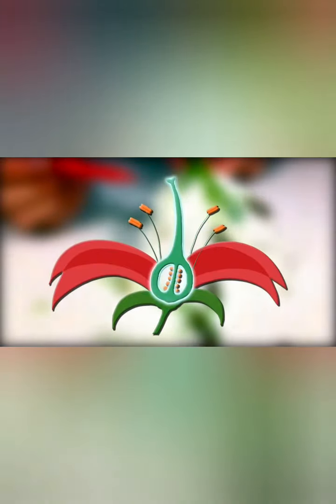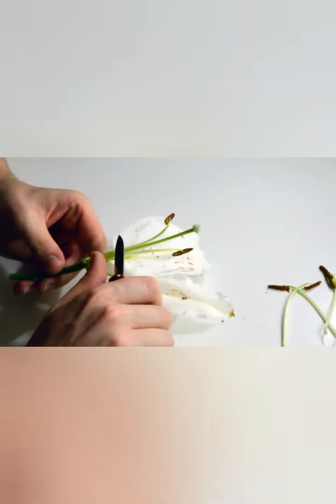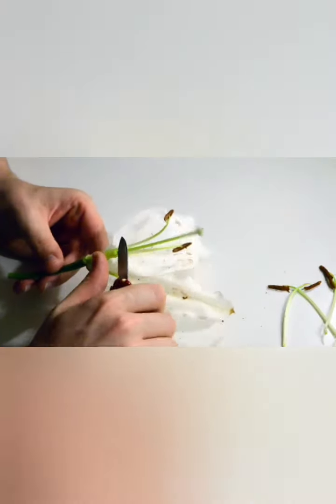In the diagram here you can see the carpel with the ovary at the bottom, the style above it and the stigma on top. This is the female part of the flower, and inside of the ovary are the ovules. Here we've got the female gametes. We can now cut into the ovary so that we can get a little bit of a closer look of what this looks like on the inside.